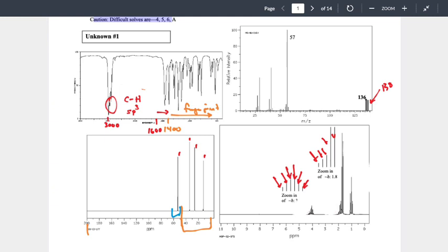The next thing we could do is look at our multiplicity. I don't like starting with the multiplicity because it's harder to evaluate. Okay? But what's happening within our multiplicity is our signal splits. Okay? And what we reference there is something known as Pascal's triangle.